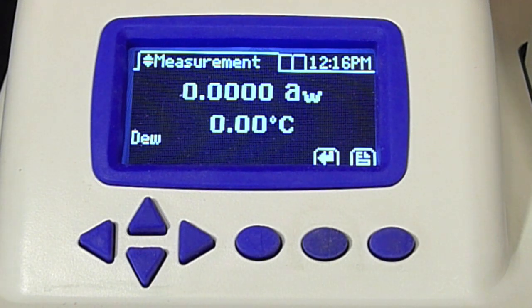The instrument is now warming up to a preset temperature. I've set the temperature to room temperature, or 25 degrees Celsius. If you're required to read samples at a specific temperature, you would set that specific temperature instead.